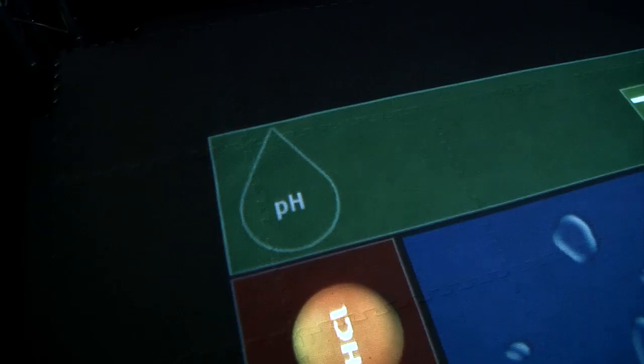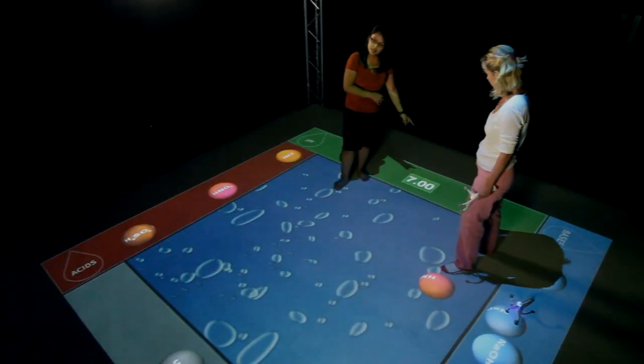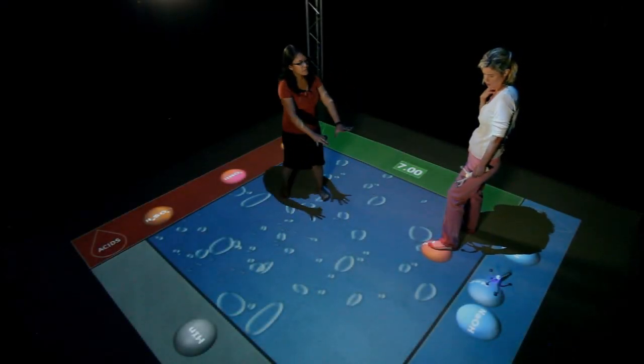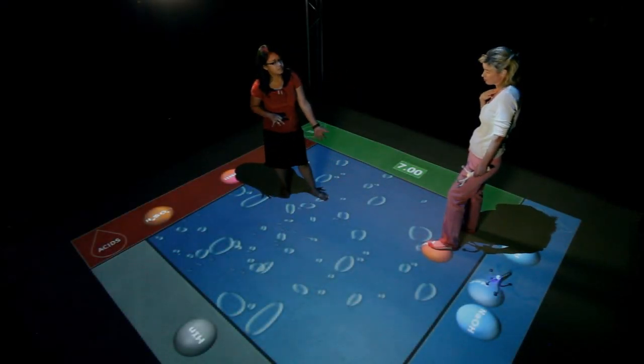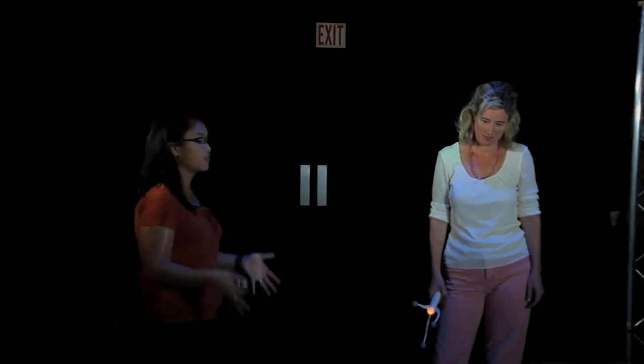This is a pH. Will be the pH number. You'll want students to also see that this number will play a role. Final thing is there's this really big open space here. And what do you think this could be? At first I thought my feet would get wet. So it looks like water, but it's not water. It's water. It is water, but it's not real water. This is our virtual lab. This is a virtual flask. And this is where we're going to be placing acid and base molecules. Just like in the lab, to create a solution.